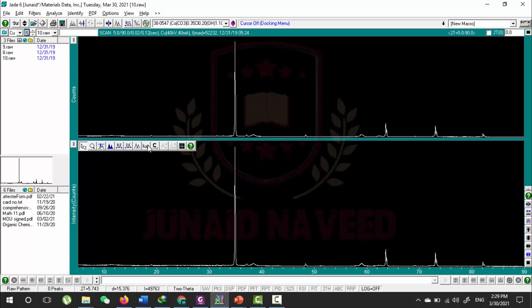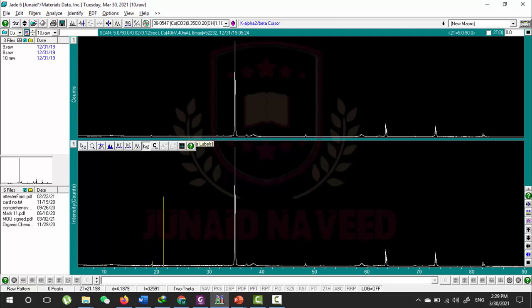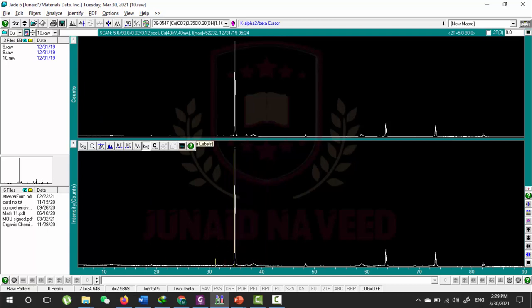This is the K Alpha and Beta lines. You can see the K Alpha and K Beta lines of the active anode. In my case, this is copper in the main pattern.